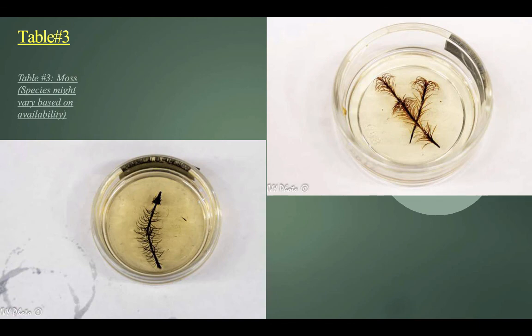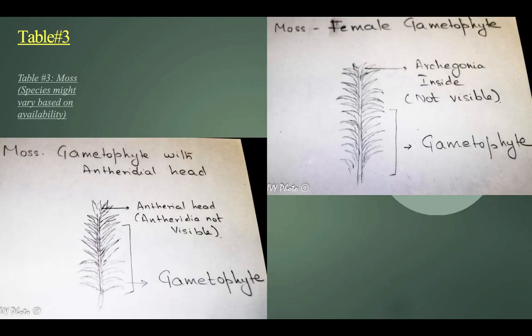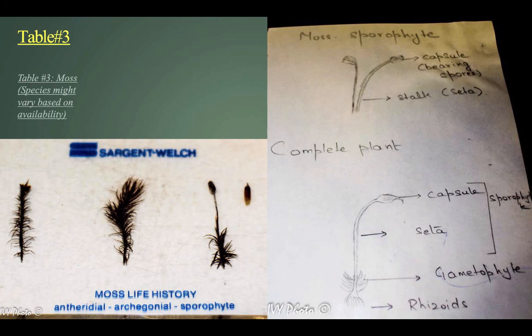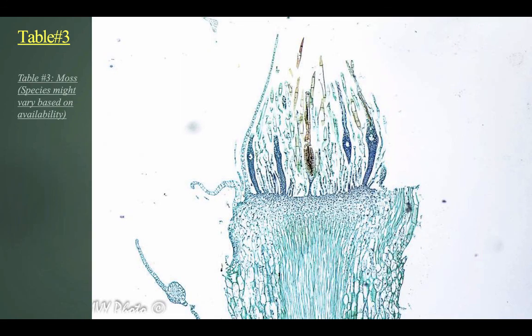And here it's a little bit easier because you only have to look at sexual reproduction. So they're going to have you draw and label the gametophytes and the sporophytes here. And they basically differentiate by both male and female. So you can see that. It's a great one of the male gametophyte right there. And so it's going through and asking you to label all these different parts. And you can use any of those that you like.